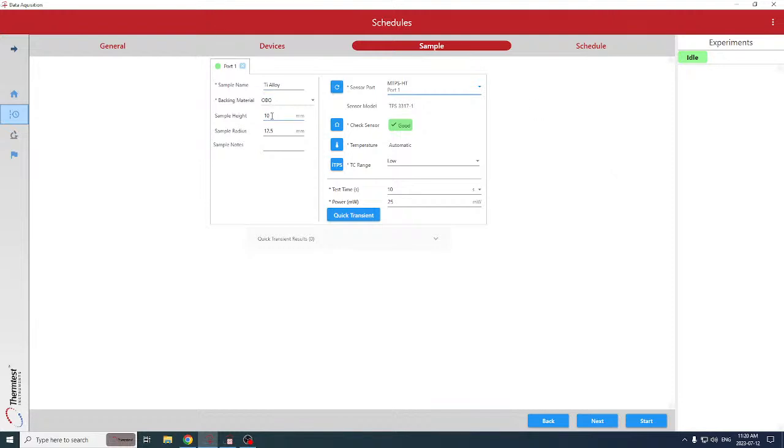So it knows the numerical representation, but when it's making its iTPS measurement, it's actually looking for the effects of reflection. If you have a semi-infinite body and you measure past that semi-infinite body, the instrument knows that the time of measurement needs to be less than the reflection effect. When it hits the boundaries, it bounces back. It can see that in the raw data, and it recommends a power and time less than the time it takes to cause reflections. So it's a very smart algorithm for determining the parameters. It really reduces the necessity to iterate and develop your own parameters.